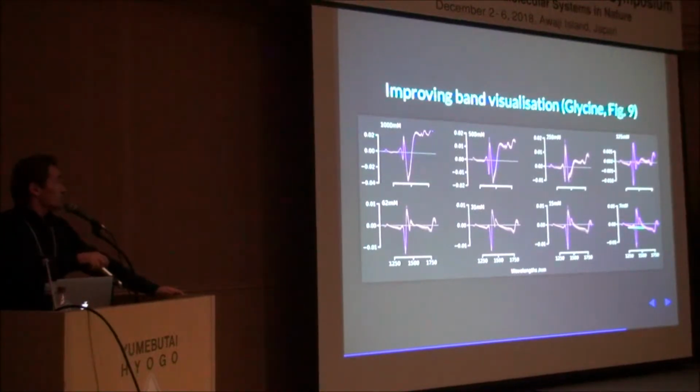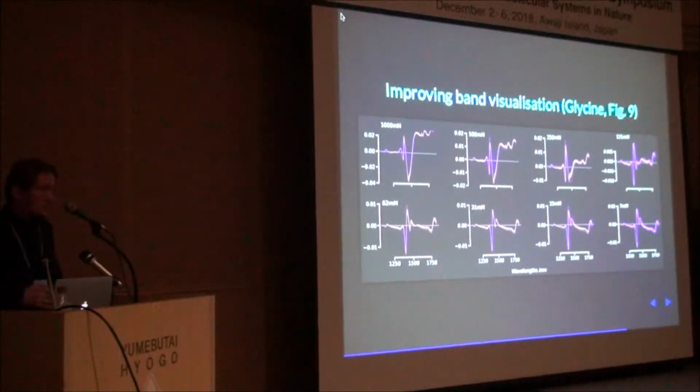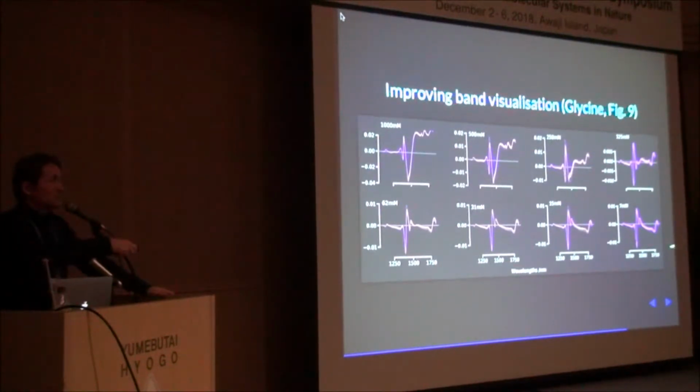These are 1 molar, and this is all the way down to 7 millimolar. These are all experiments. This is by subtracting all consecutive. So what you can see is that the spectral pattern over 10 experiments for each consecutive of the sample is consistent. It is made consistent by subtracting the appropriate water spectra. So even at 7 millimolar, your spectra can still be consistent. That is the proposal. And you can see a lot more.